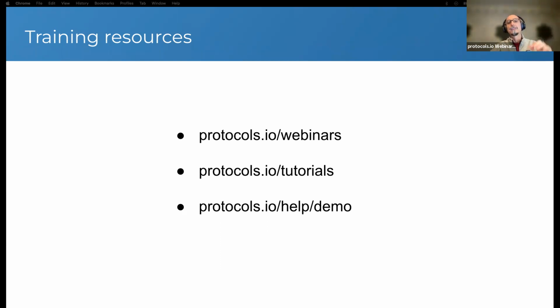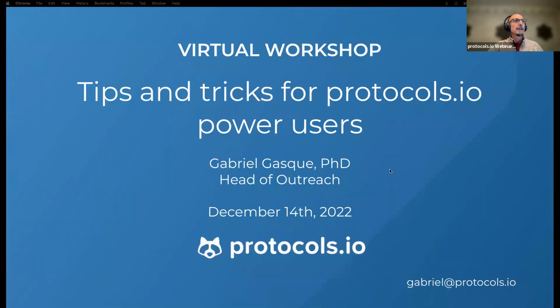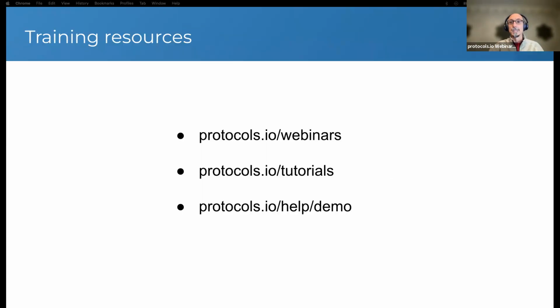And just in case you are not familiar with the platform, I would like to point out that the platform is really intuitive. And the best way to familiarize yourself with the many different tools and functionalities of Protocols.io is to just log in and play around.